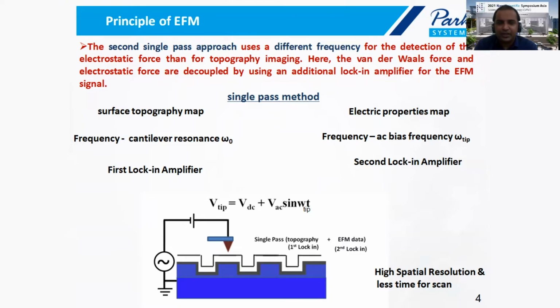This single pass method is superior to the lift mode technique, because this method gives you high spatial resolution, and it also requires less time for scanning.